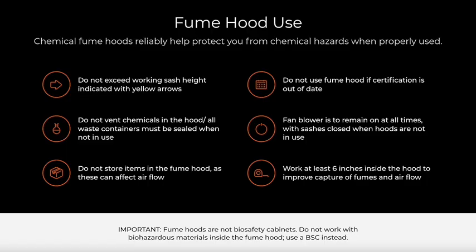Do not vent chemicals inside the hood. All waste containers must be sealed when not in use to prevent any accidental releases of chemicals. Do not store items inside the fume hood. This can affect the airflow and reduce the effectiveness of the hood. Make sure the certification of the hood is up to date. If it is not, do not use the hood. The fan blower should remain on at all times, with the sashes closed when the hood is not in use. Work at least 6 inches inside the hood to improve the capture of fumes and airflow. By following these guidelines, you can help ensure that your fume hood is working correctly and protecting you from chemical hazards.